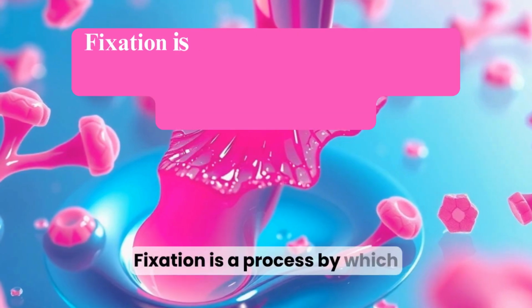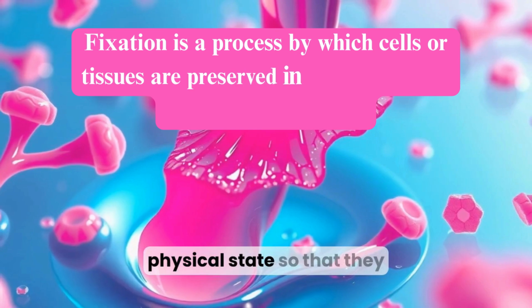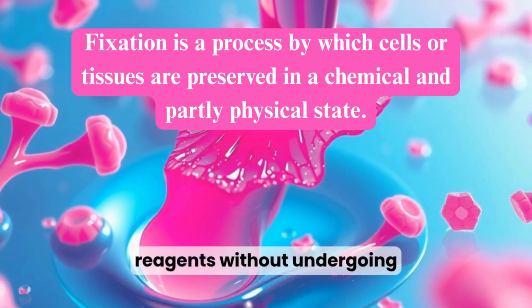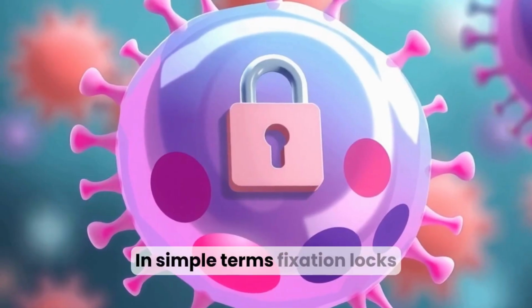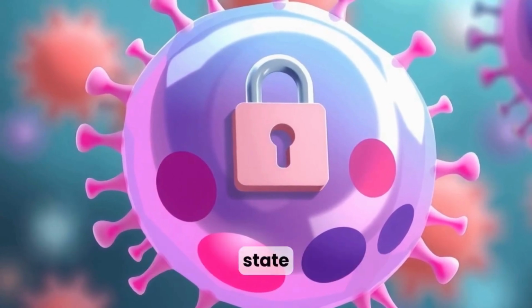Fixation is a process by which cells or tissues are preserved in a chemical and partly physical state so that they can withstand further processing with various reagents without undergoing decomposition or distortion. In simple terms, fixation locks the tissue in a condition that closely resembles its living state.